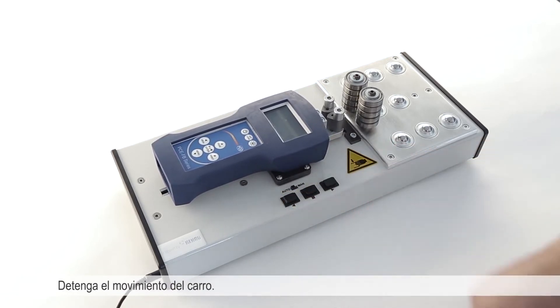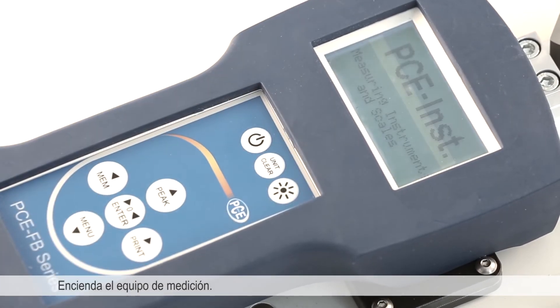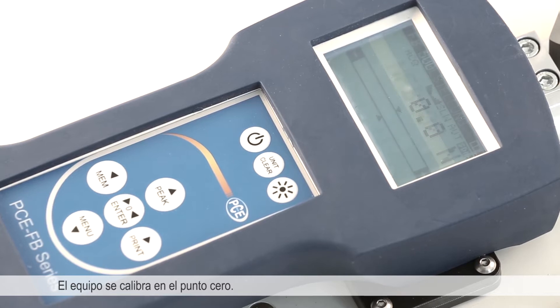Then stop the carriage movement and switch the measuring equipment on. The equipment calibrates itself to the zero point and is returned to the initial state.